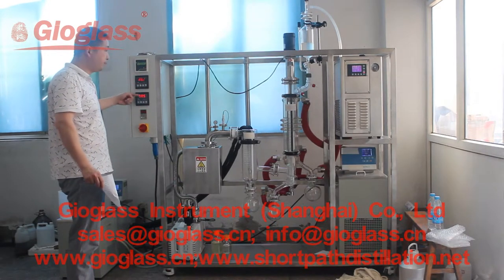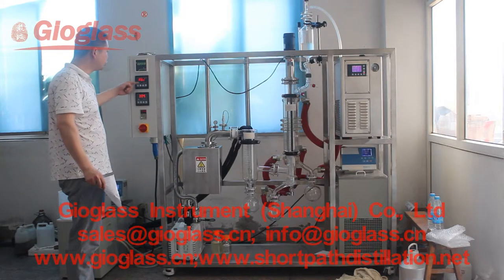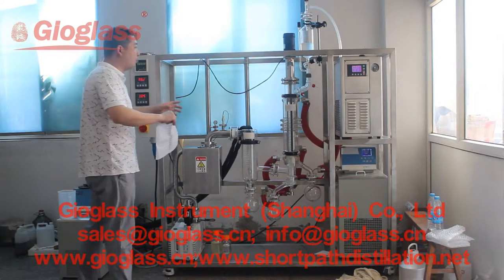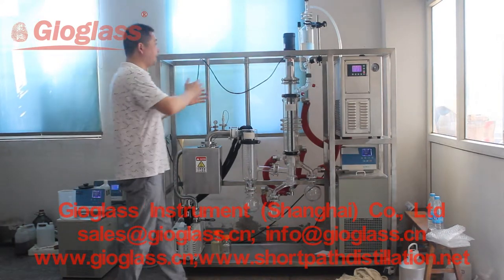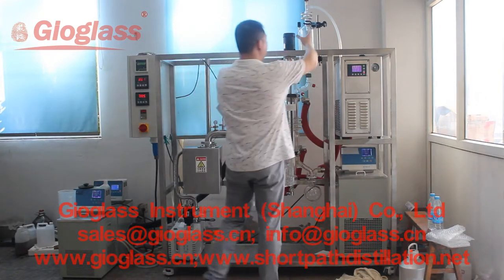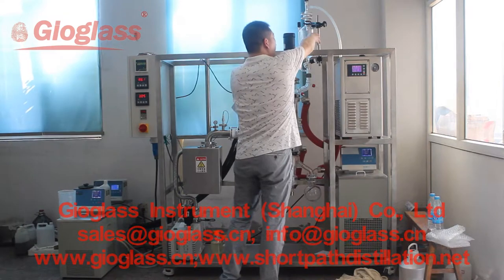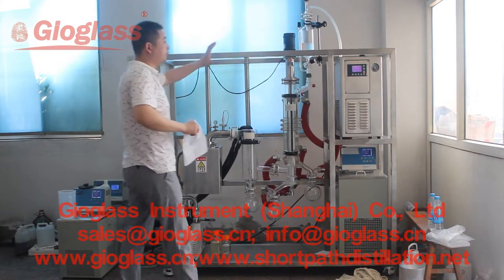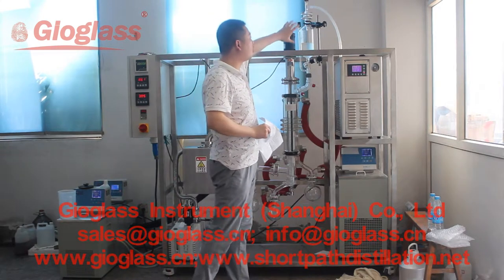These two meters show the heating temperature. If you want to use the heating bath to preheat, it can keep the material warmer.